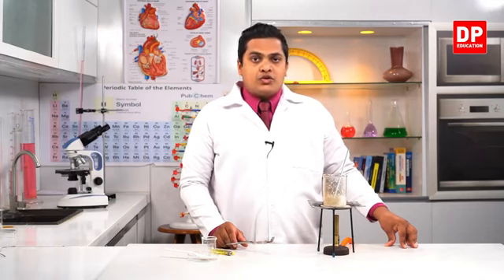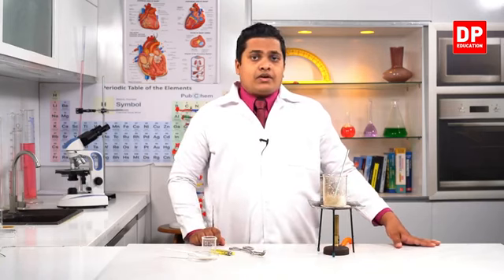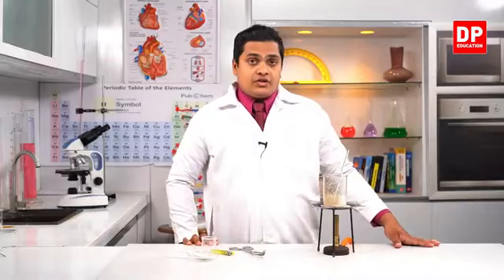Here the salt crystals dissolve inside the water to make a salt solution. So when I'm vaporizing water, I can revert the process to obtain salt powder, right? So dissolving salt in water is a physical change. So we'll observe the other examples that we can see in our day-to-day life to get some idea about physical and chemical changes. Right, so let's proceed to the next things.